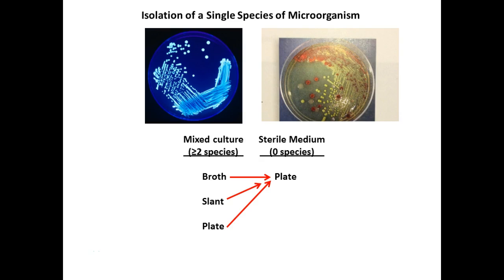So I'm gonna clean off the outside of this one. So this is not a pathogen. This is not Klebsiella. You can pass that around to see what we hope our plates will look like next week.